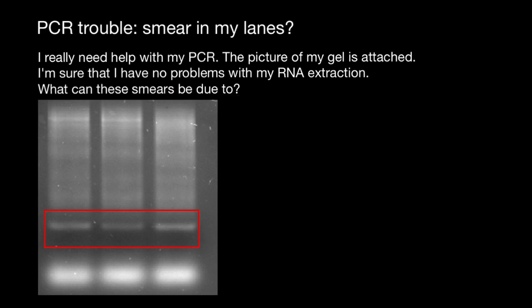First of all, for those people who sent me their gels, it would be nice if you also included your ladder, positive and negative controls — the whole picture of your gel electrophoresis and not just a part of it. It would be much easier to analyze.